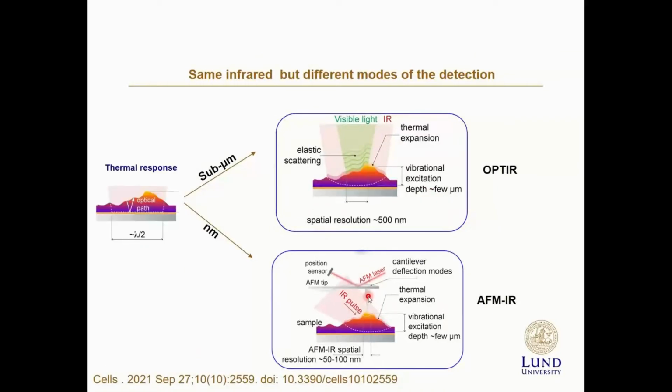So how does it work? We still have infrared that illuminates samples and causes a thermal response. However, there are new methods of detection.